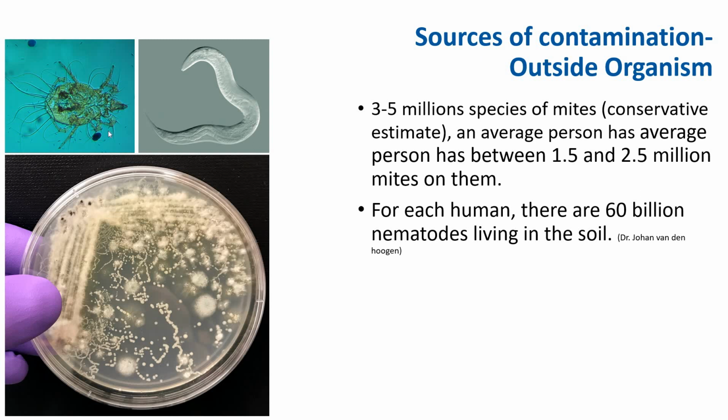Mites are these little arachnids, a group of insect-like organisms like spiders. They cause major problems in mushroom cultivation. You can see there are some mites in this, and they might track and bring in bacteria and fungal spores from the outside, and create a mess.